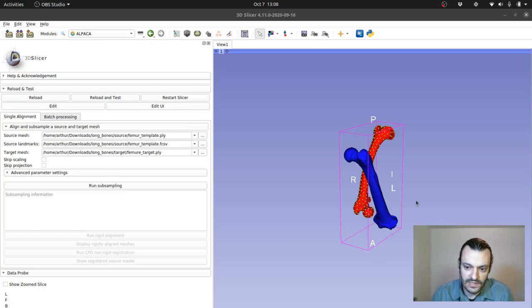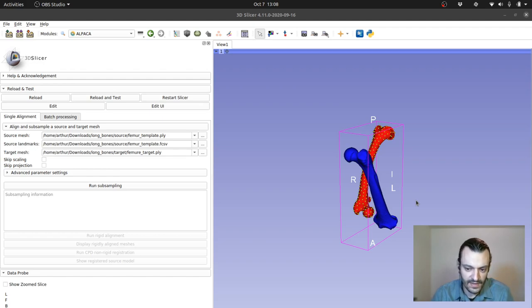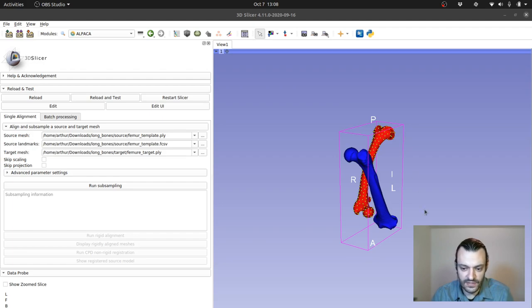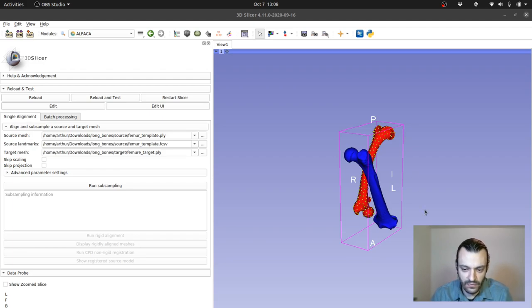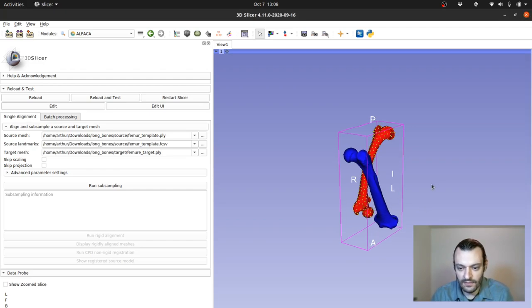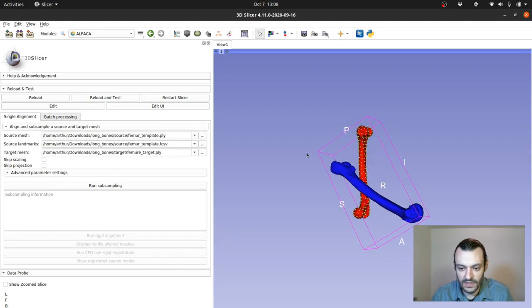So the best way to explain how ALPACA works is essentially to run through the pipeline using an example. Here I'm illustrating two meshes. They are both femur meshes, both from gorilla specimens. The blue one corresponds to a male gorilla and the red one corresponds to a female gorilla.